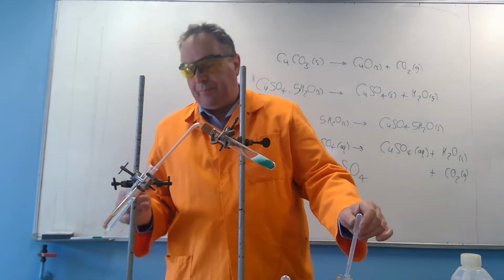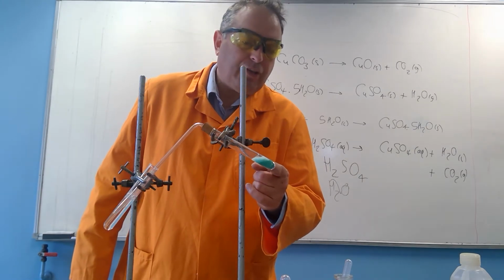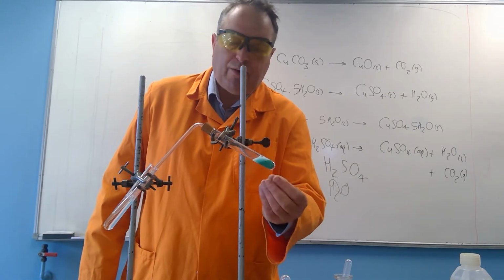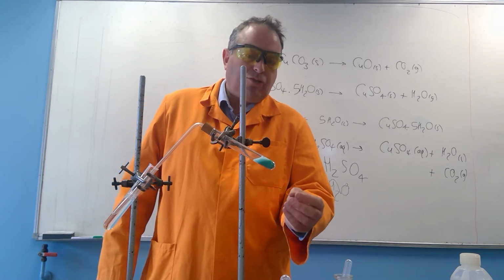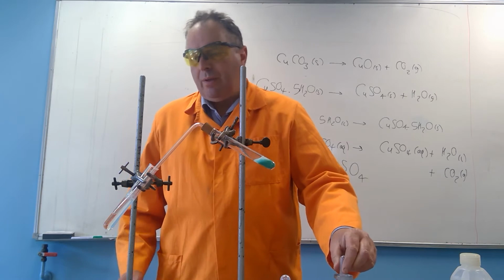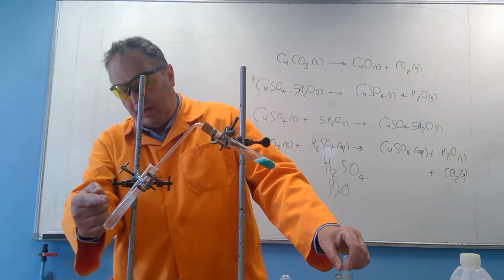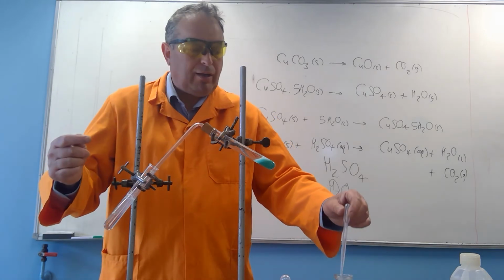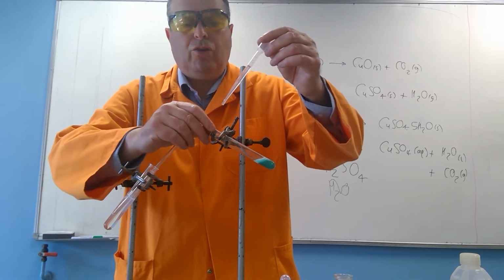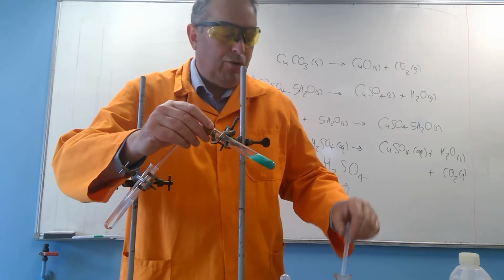That's the fun bit. So on the right there's the copper 2 carbonate, which is bubbling away with the acid. It's going to make copper sulfate, so it should go slightly blue in colour. Some bubbles are going into the freshly made lime water. I can see it slowly going cloudy, not colourless, cloudy, and you can say cloudy or milky.